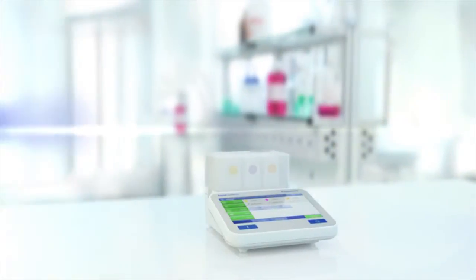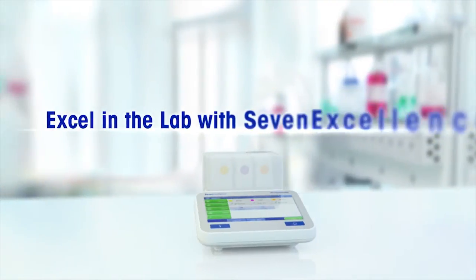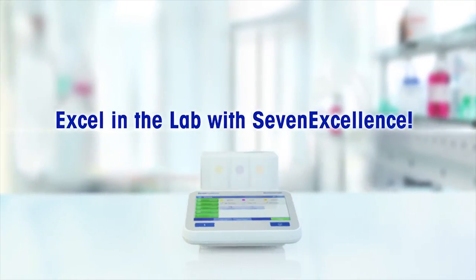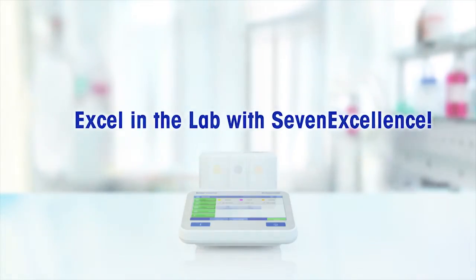Enjoy unmatched pH performance and excel in the lab with SevenExcellence.